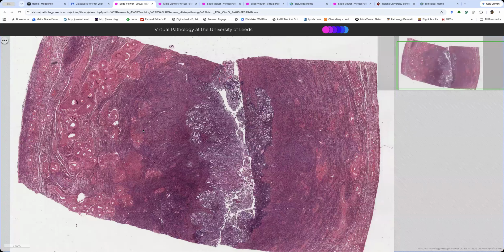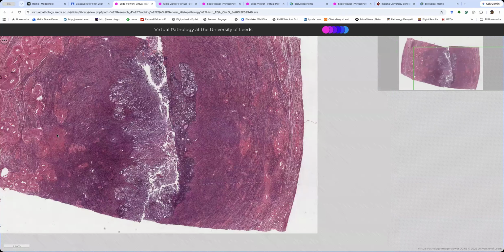We have to stage it and we have to measure the distance to the outside, which means that when you're cutting, you need to get a nice section of the bit opposite the cancer, because this is the best thickness that we're ever going to get. Imagine if the cancer was filling like half this and growing into the middle. Really hard to measure the distance to the lumen to the deepest point and think, where does the wall begin and end?